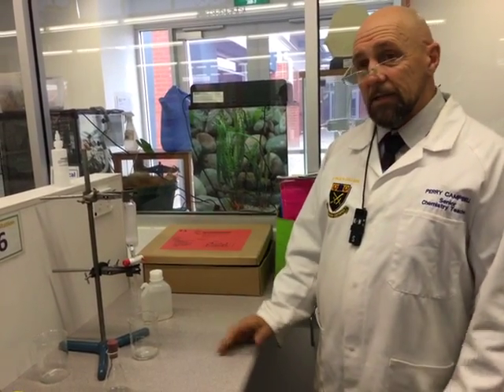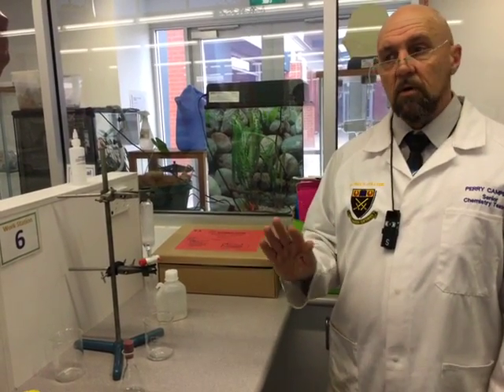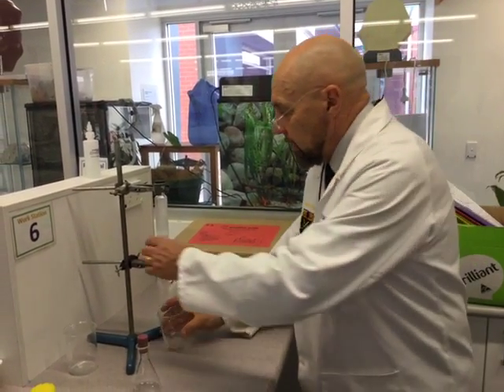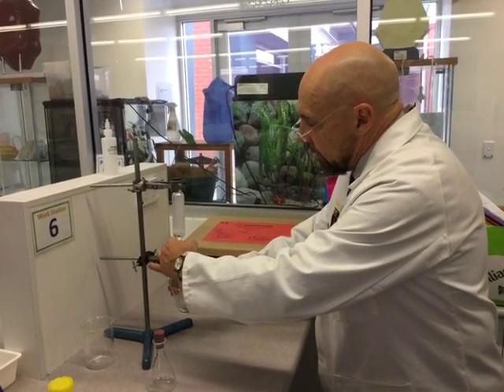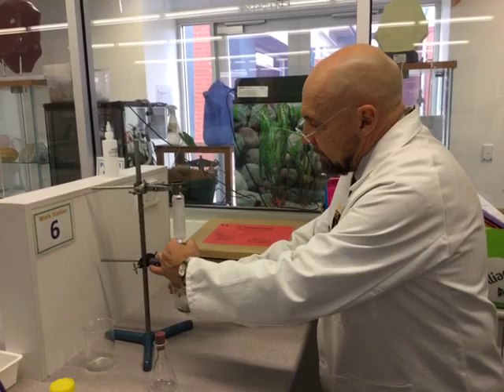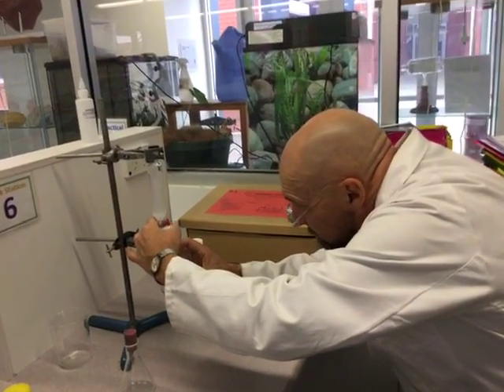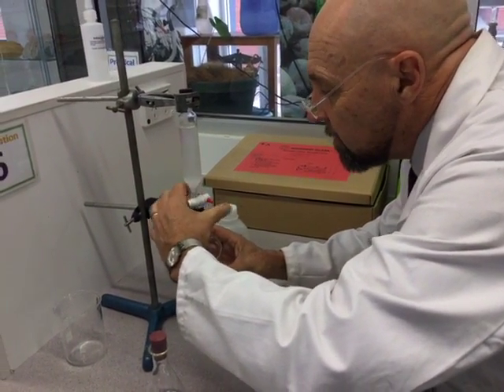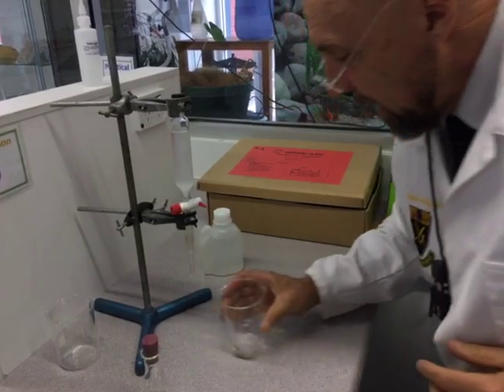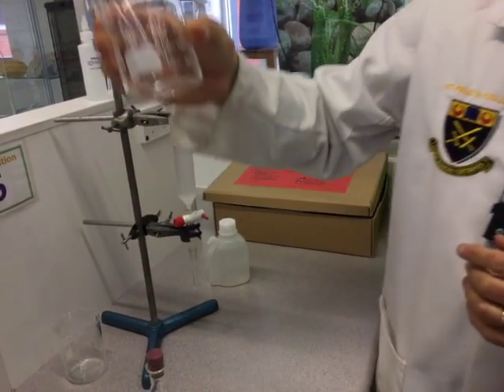It looks like the ester is going to be colourless in this practical, though some of you might find it's going to be a pinky colour. I'm just going to run that through — it's almost like a titration. I probably lost a little bit there. There's a little bit of ester floating in there, but that's okay — I'm not going to worry too much about that.